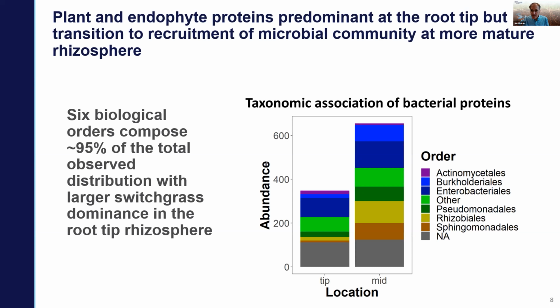I think the answer is yes, really, in a way. Most likely, with the membrane sampling approach, the proteins have to be at least soluble enough to get to the membrane. So we're probably not sampling the proteins from the roots, say, but we would be sampling proteins that might be exuded by the roots. So a number of different proteins might be exuded from the plant roots, or exoproteins would be exuded by bacteria. Also, certainly lysed bacterial cells could be another source of these proteins. All of these, I think, could definitely be a part of it.